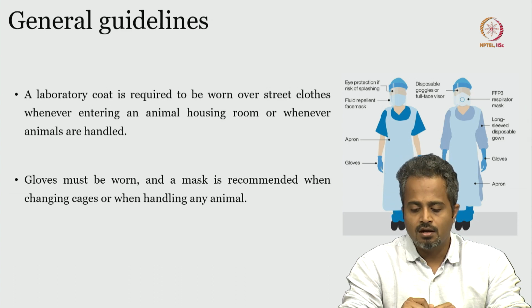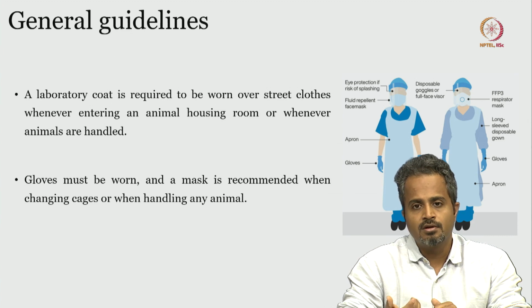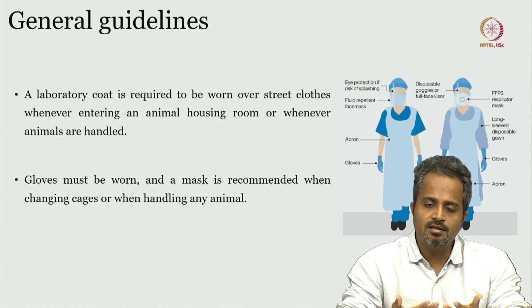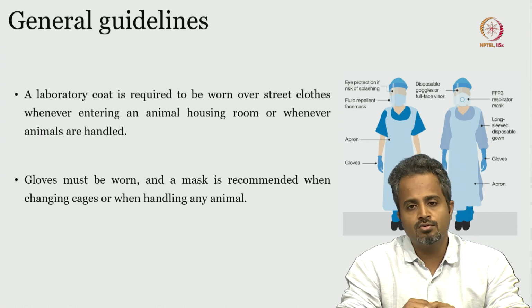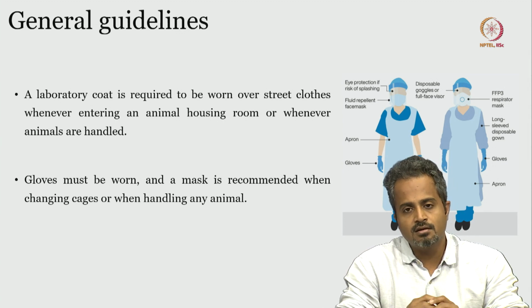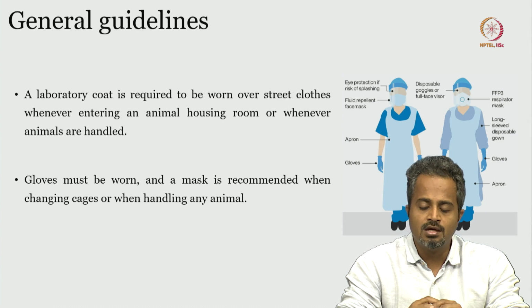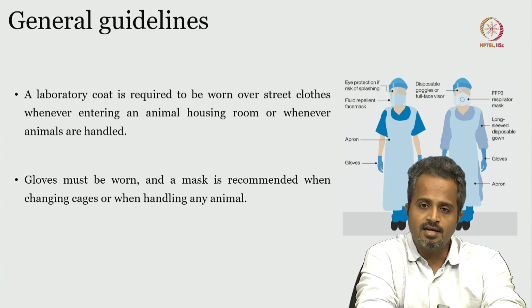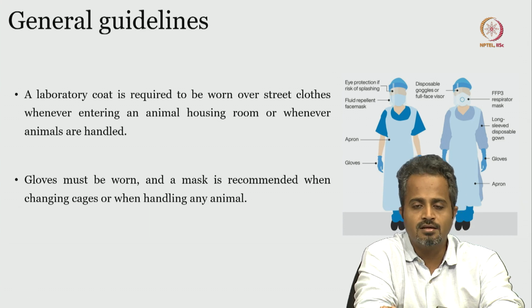And of course eye protection, if you are going to use some fluids to clean the rat, or some chemical disinfectants to clean the area where you are going to perform the surgery, then masks and gowns are also required. So these are the general lab attire that you need to follow before entering the lab.